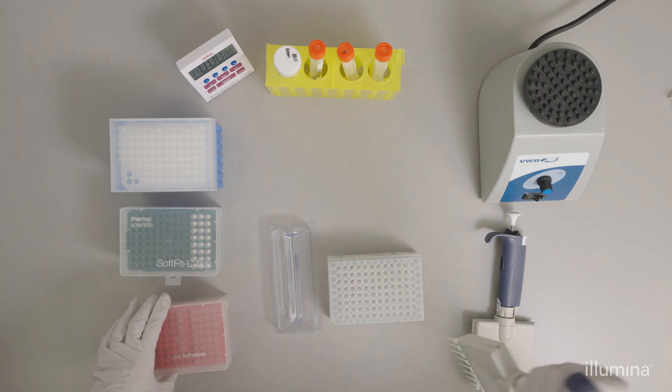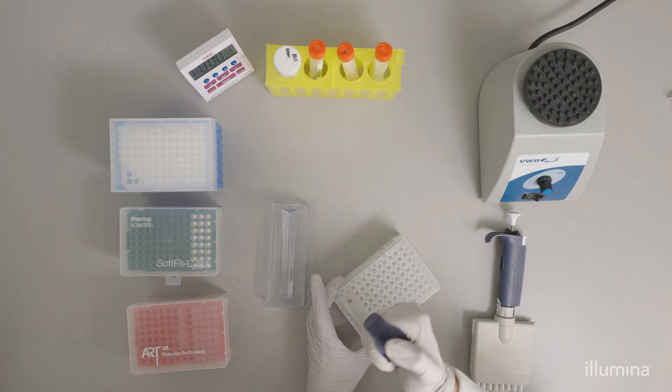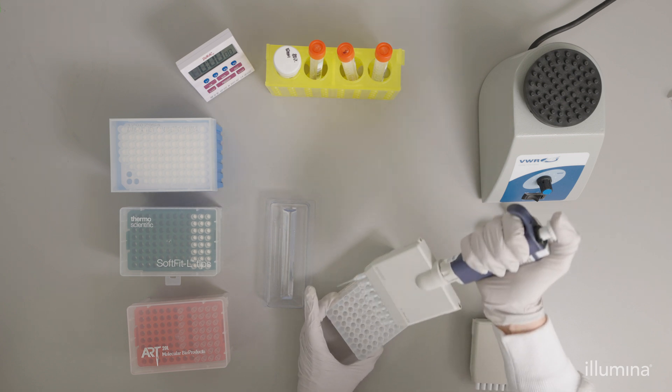After the final wash, use a pipette with fine tips, here we use a 20 microliter multichannel pipette, to remove any residual ethanol from the wells and check the bottom of the wells for any residual ethanol.